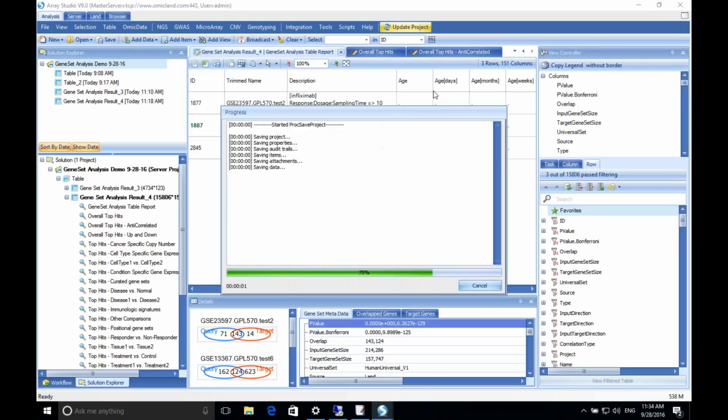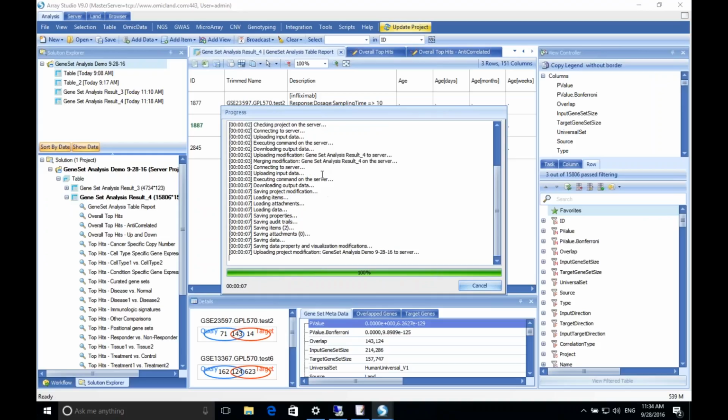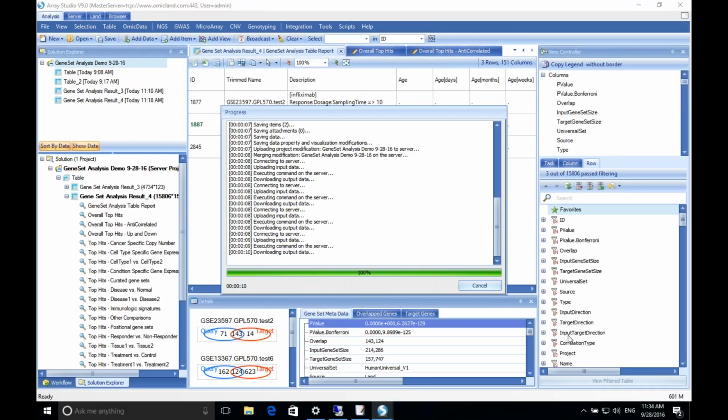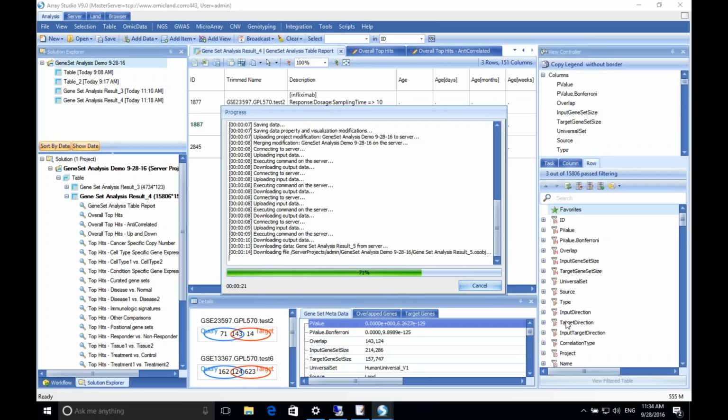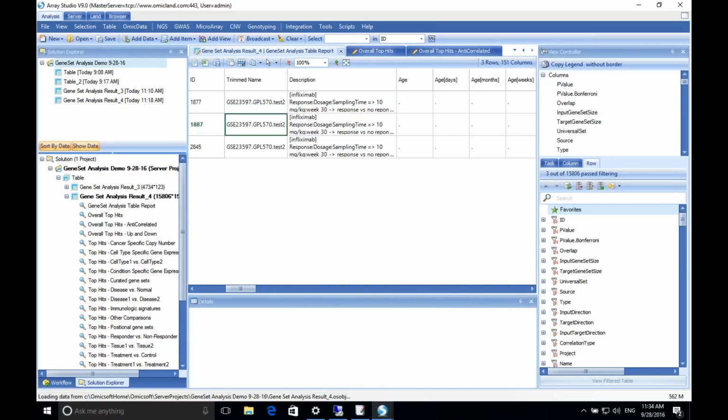Let's go ahead and take a look at the results of this one. We're maybe two to 3 minutes away from being done. If you have additional questions, feel free to throw them into the question box. I think I've answered all the ones that have come in so far, but we're happy to take questions for the next 10 minutes or so. So here's the result of that up and down list.